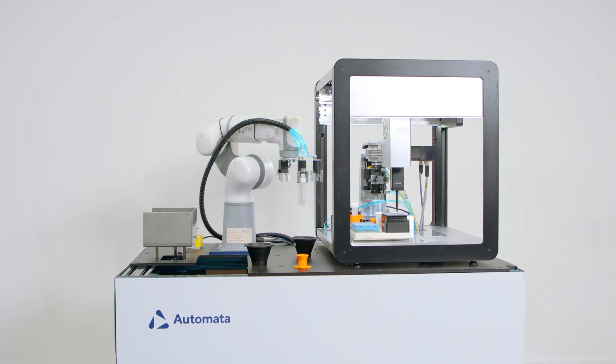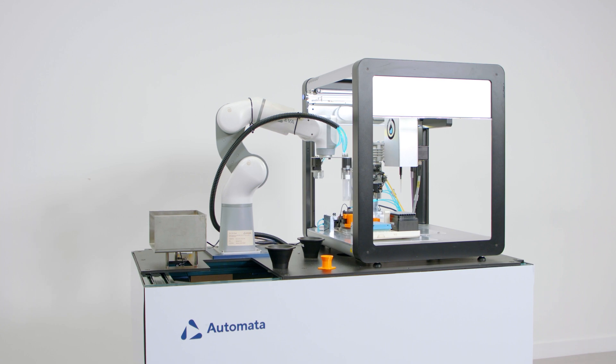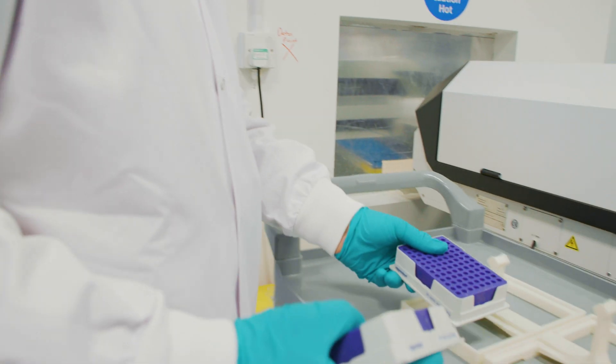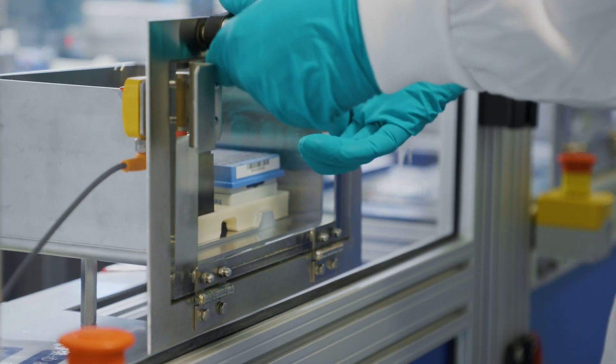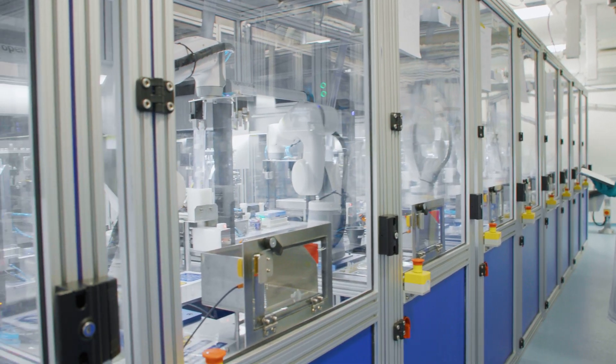The benefits of automating the entire process would be, first of all, speed. Having a robot manipulating the entire prepping of a microplate would be a lot faster and a lot more precise — human errors would be completely eliminated. Another advantage is repeatability: the robot can perform the same actions as many times as desired with no risk of inaccuracy.